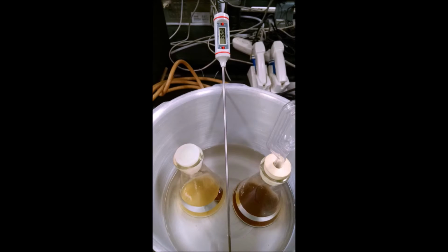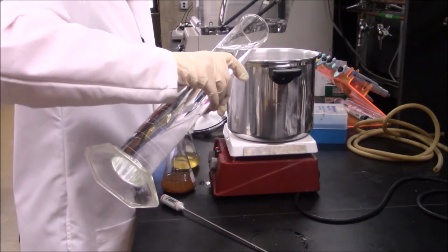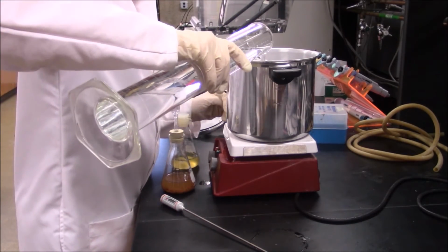The flasks should be kept at a constant 35 degrees Celsius in the pressure cooker over the course of several days or until the bubbles of carbon dioxide are no longer being produced. The enzymes need a warm environment to convert the cellulose into glucose, but the environment cannot be so hot as to kill the yeast. Do not replace the lid on the pressure cooker during this time.